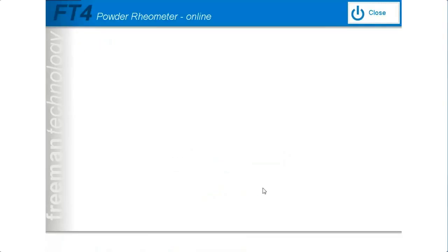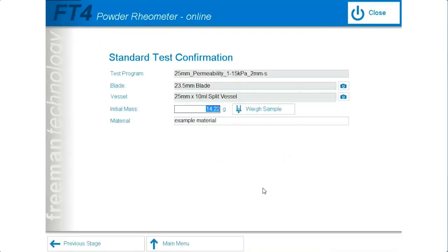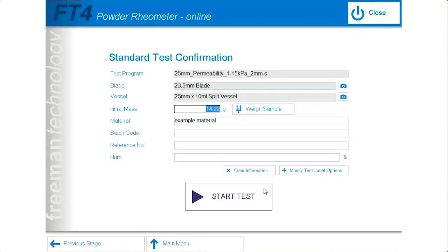And once again, it'll prompt you to record the same data labels and information about the given sample that you are testing in a given test. So I'm not actually going to run this test again for the sake of time. Instead, we're just going to look at some pre-recorded data and use it to analyze the materials in a battery space.